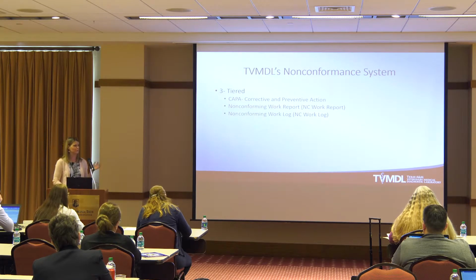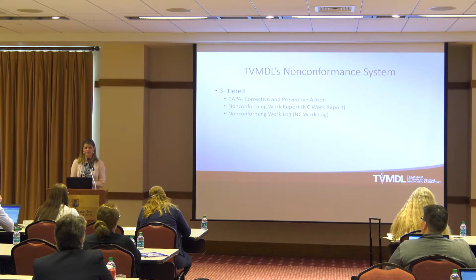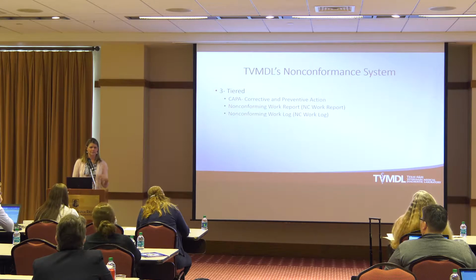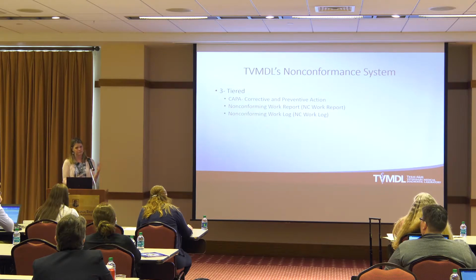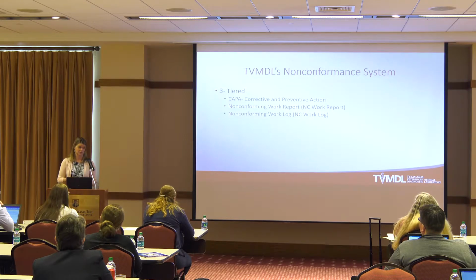The reason why we have ours set up this way is because somewhere along the line, our executive management decided that, for example, when we perform an internal audit, if we see an incorrect correction maybe only one time, maybe that is not as egregious as some other kinds of nonconformances. So management said, hey, let's give the sections an easier way to work through that nonconformance that isn't through a corrective and preventive action workflow.